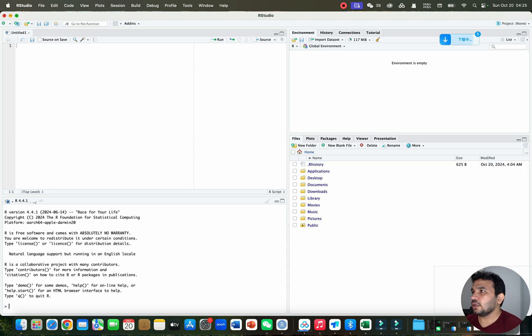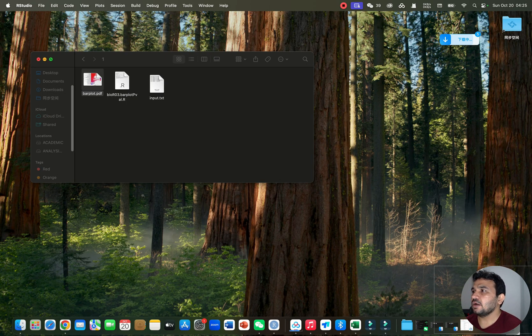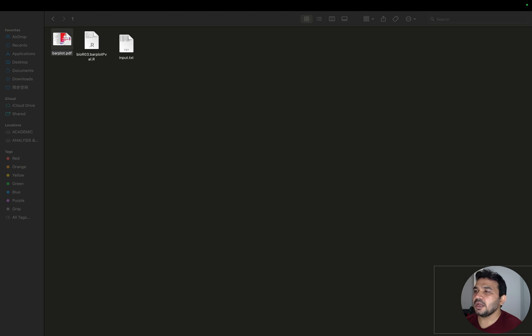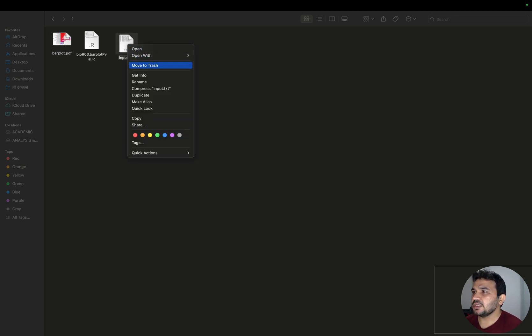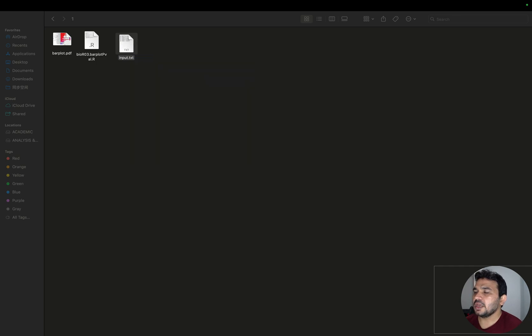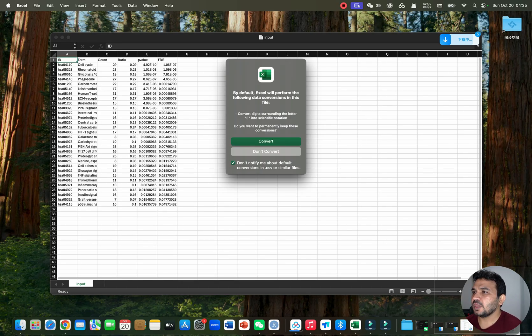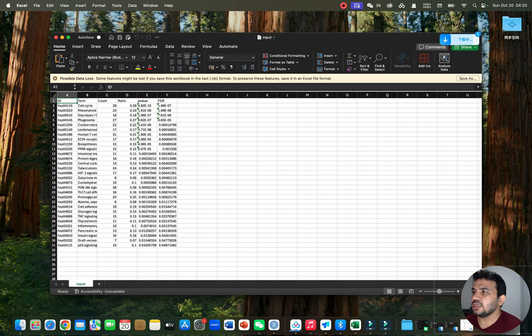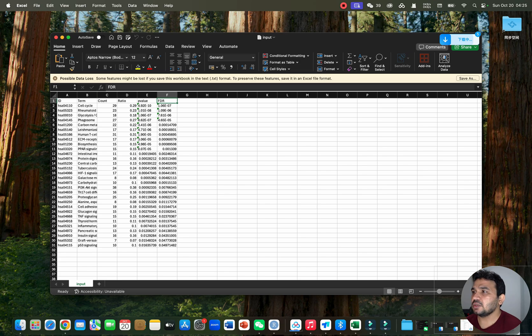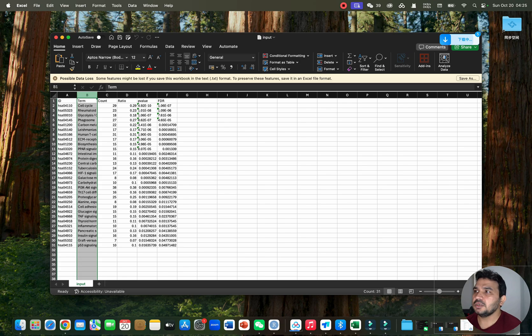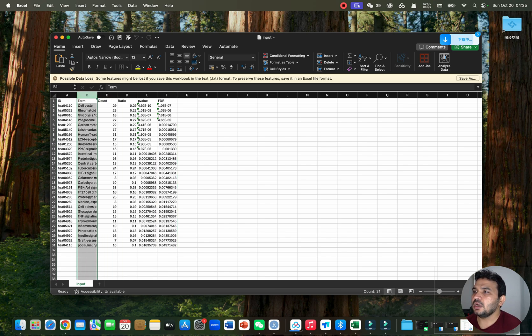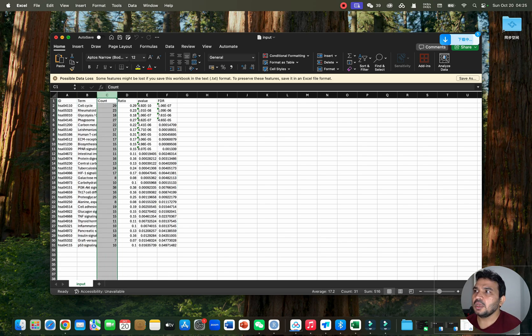Let me show you what the input file should look like. I have given you one example file. As you can see in the Excel form, we have an ID column, then terms, counts, p-value, and FDR. Among these, three are most important: the term, gene counts, and FDR.